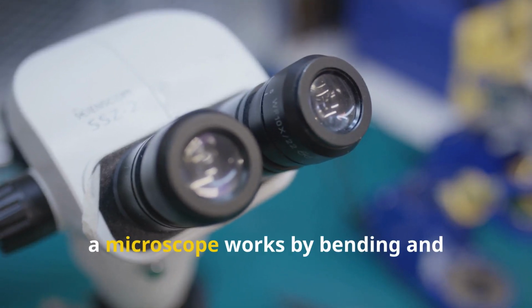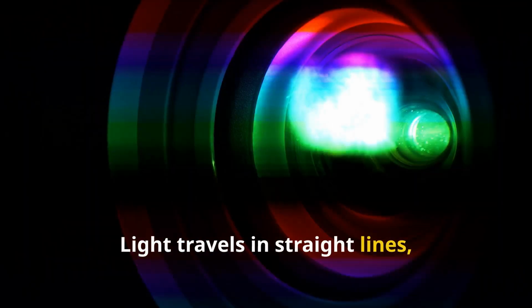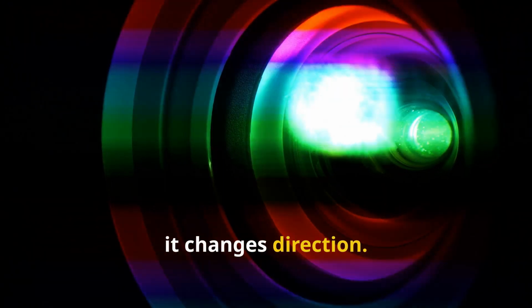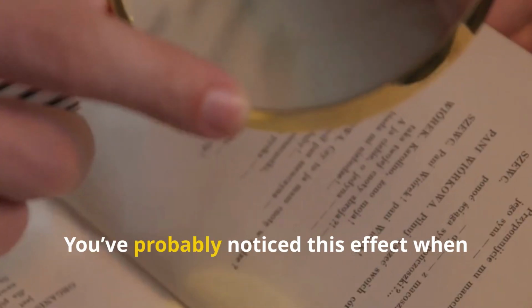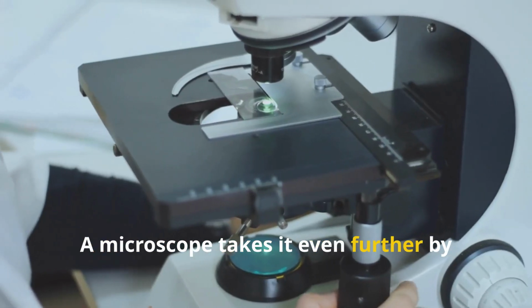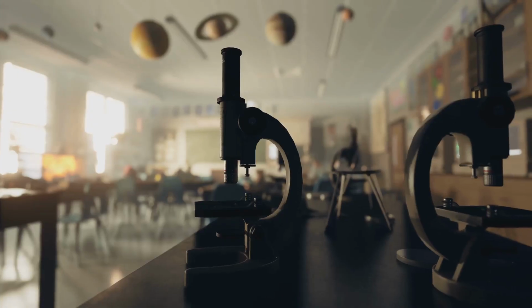At its core, a microscope works by bending and focusing light. Light travels in straight lines, but when it passes through a curved piece of glass called a lens, it changes direction. This bending of light, known as refraction, is what allows us to magnify objects. You've probably noticed this effect when looking through a magnifying glass. A microscope takes it even further by using multiple lenses to enlarge an object many times over.